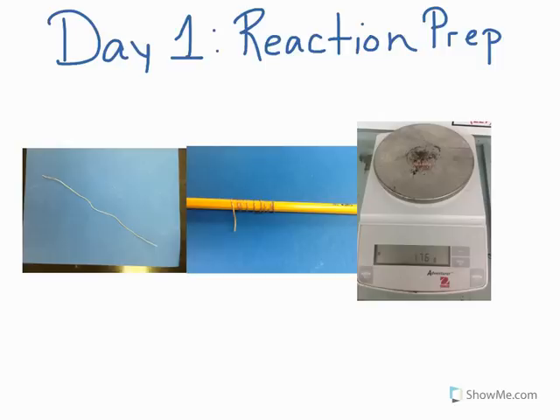room. This experiment is going to be divided into 3 days. The first day will be the reaction prep. You start with obtaining a piece of copper wire, coil it loosely around a pencil, and then find the initial mass of the copper wire and record it in your data table.